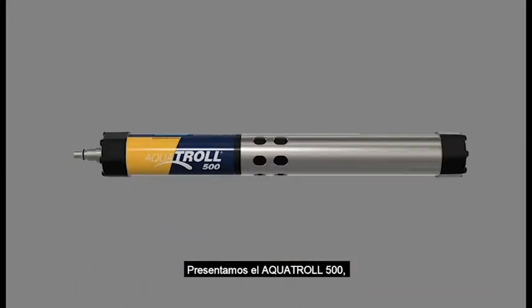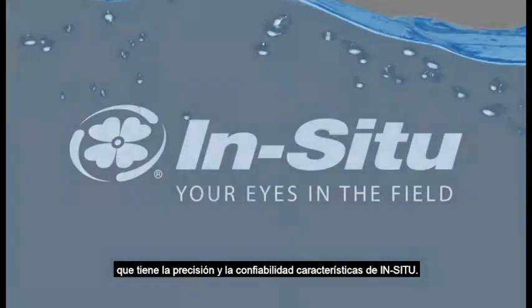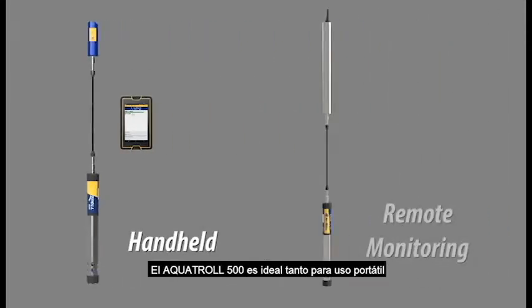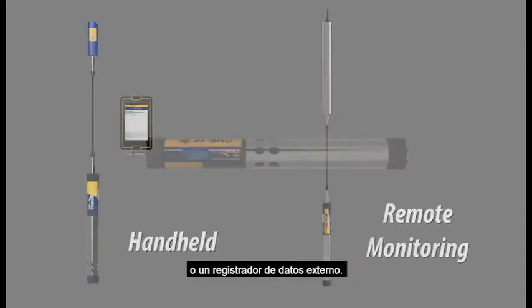Introducing the Aquatrol 500, a mobile, user-friendly water quality instrument with the accuracy and reliability you've come to expect from In-Situ. The Aquatrol 500 is ideal for handheld testing, as well as remote monitoring with telemetry or external data logger.